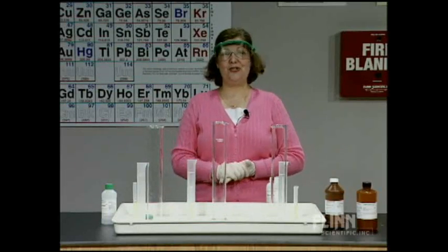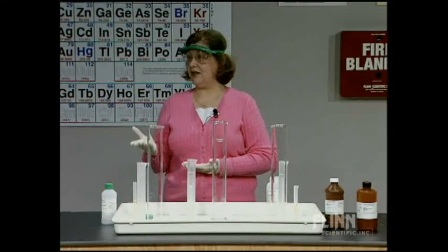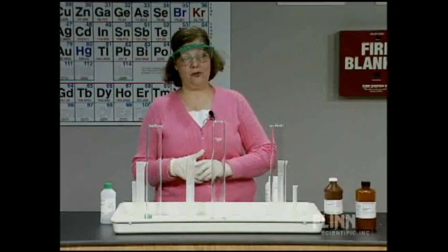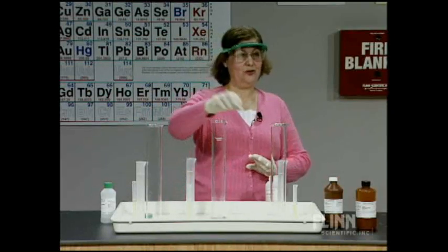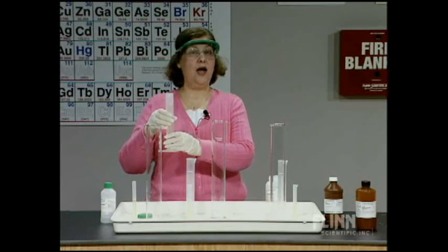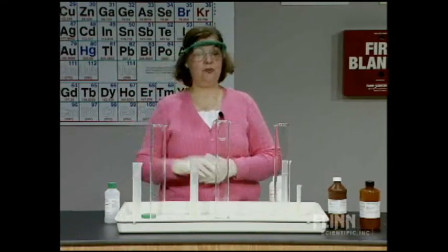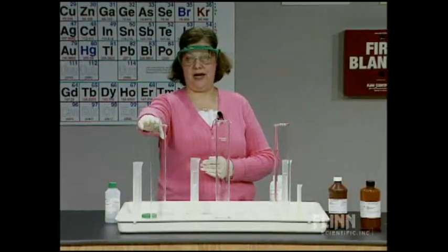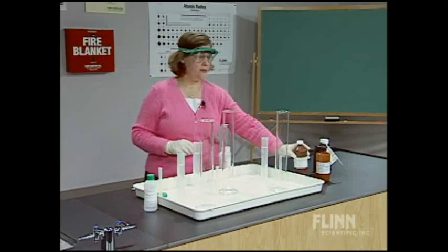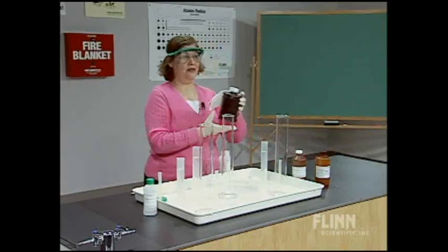Today we're going to do the decomposition reaction of hydrogen peroxide to demonstrate kinetics, and specifically the effect of the concentration of the reactants on the rate of the chemical reaction. I have three large hydrometer cylinders where our reaction is going to take place. I've pre-measured 100 milliliters of hydrogen peroxide in each of three 100-milliliter graduated cylinders — three different concentrations: 3% on my right, 10% on my left, and 30% in the center.